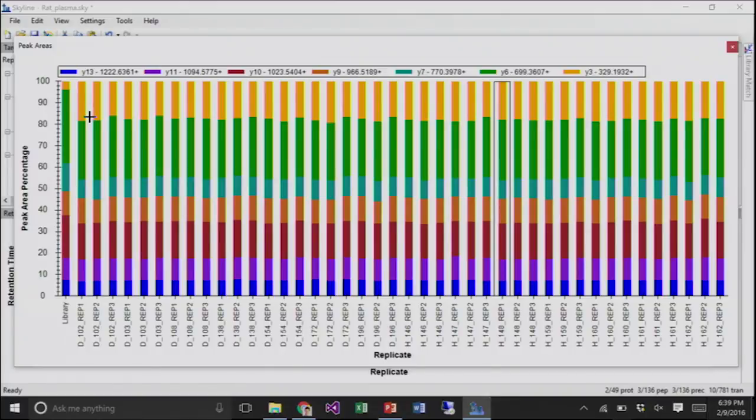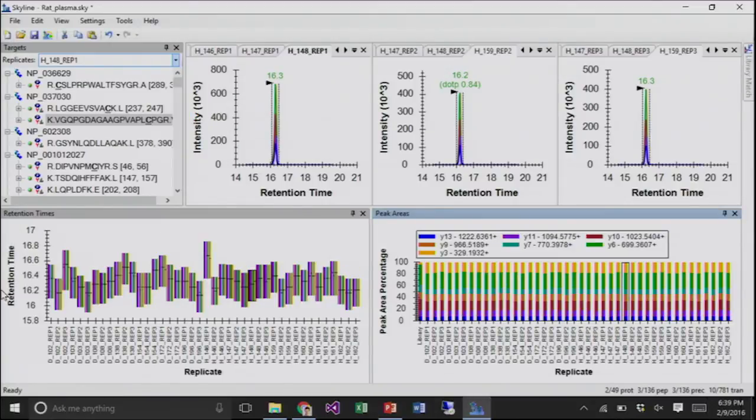And then another thing that we've said is, in a lot of cases, in this particular experiment, it's almost more important that we're just measuring the same thing every time. So does anybody have any doubt that we're measuring the same thing every time? No, we have this beautiful stable retention time. We have this beautiful stable ion abundance. We have measured the same thing every time. And so if there's a difference, even when we order a synthetic peptide, this is not the peptide we think we're measuring, we can still find something scientifically interesting.